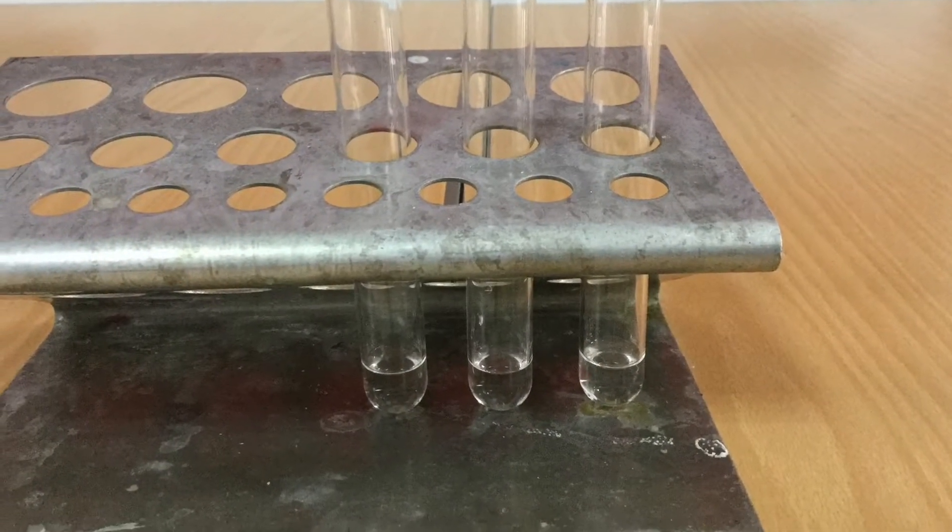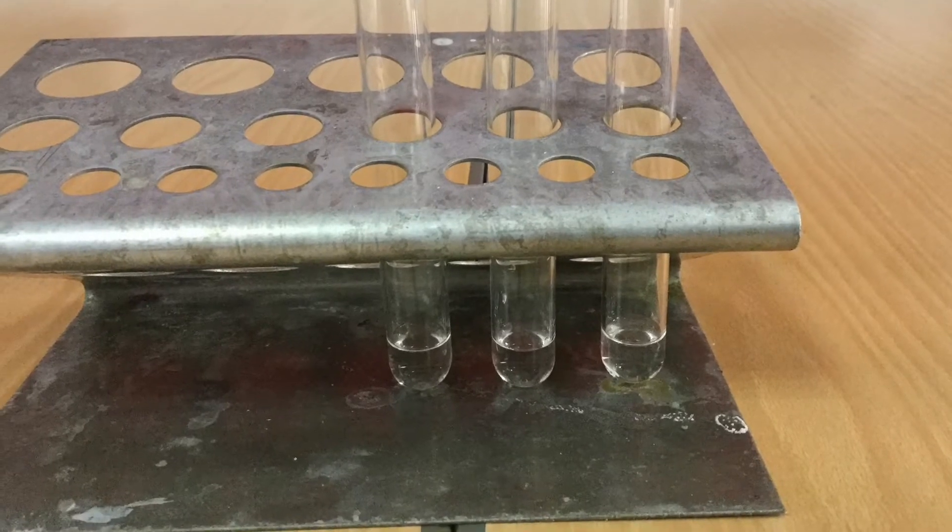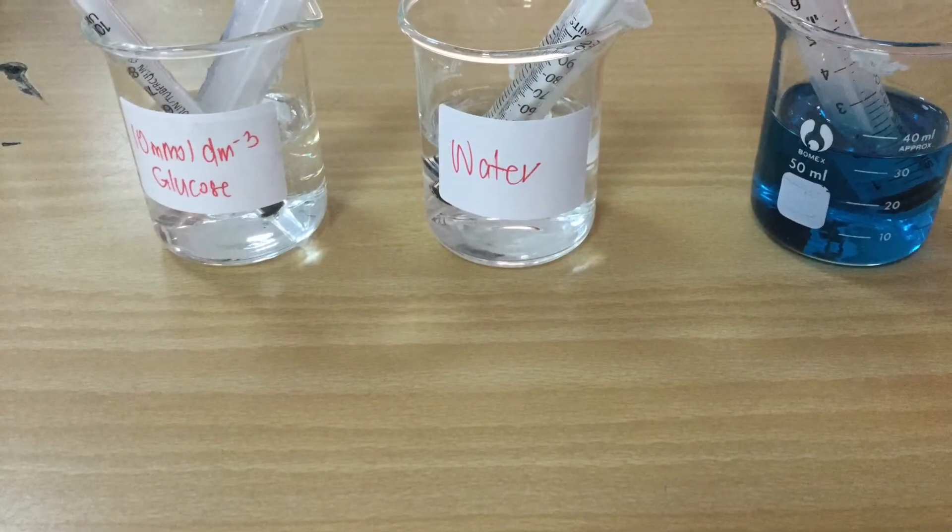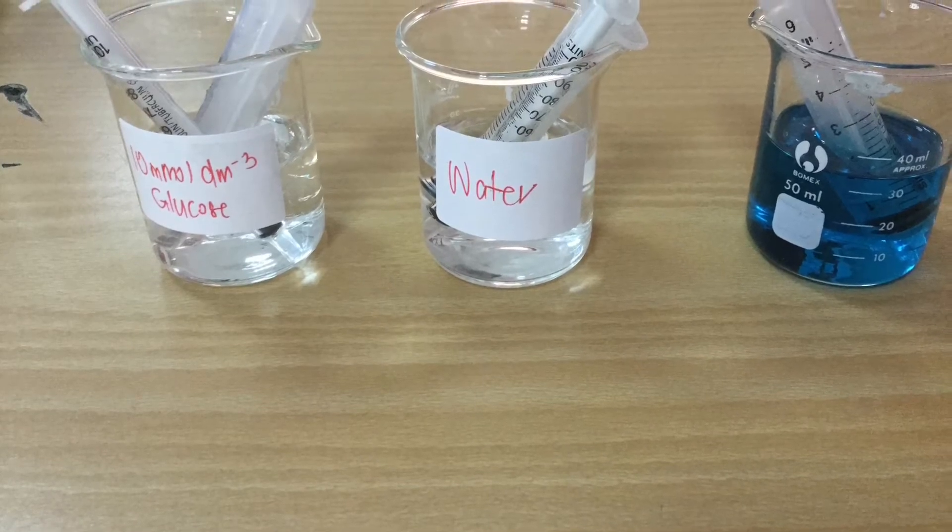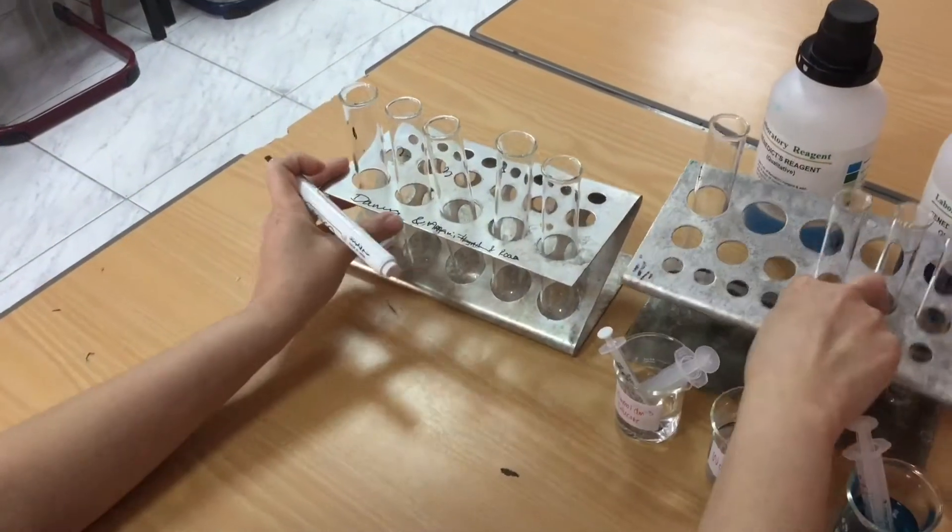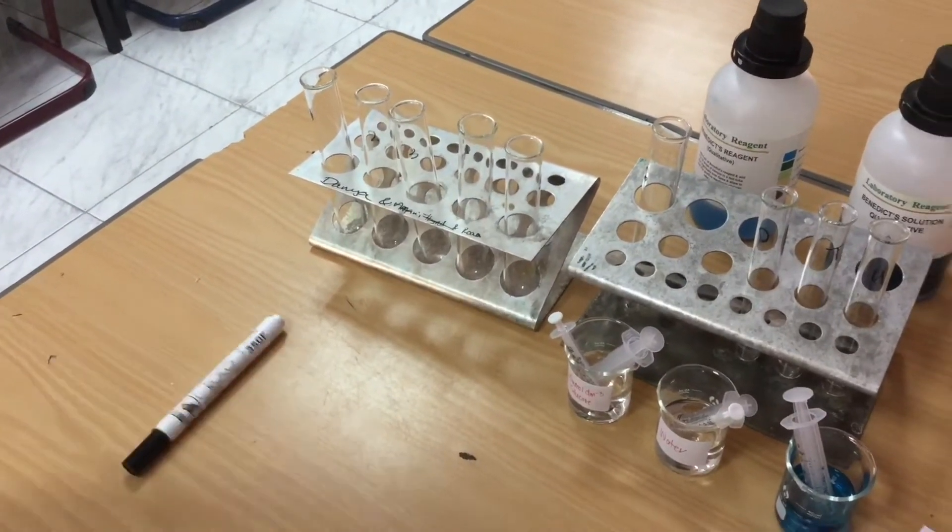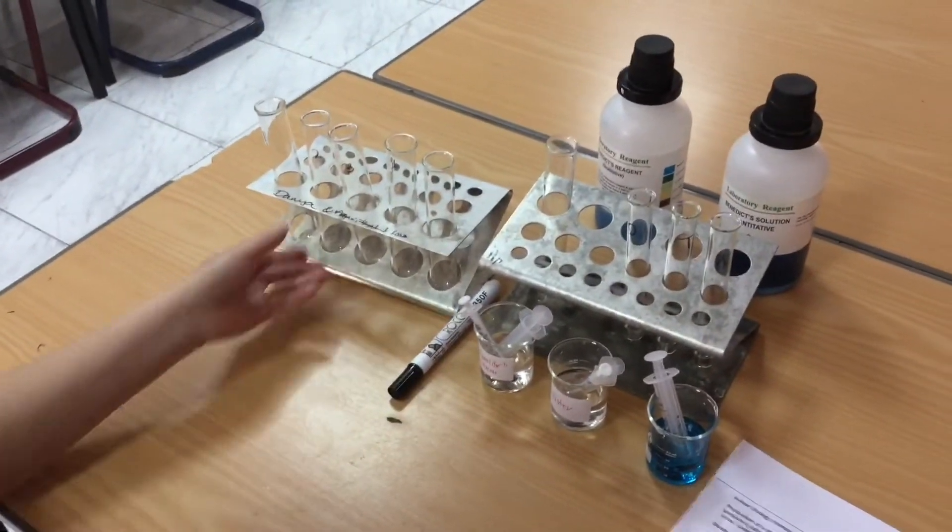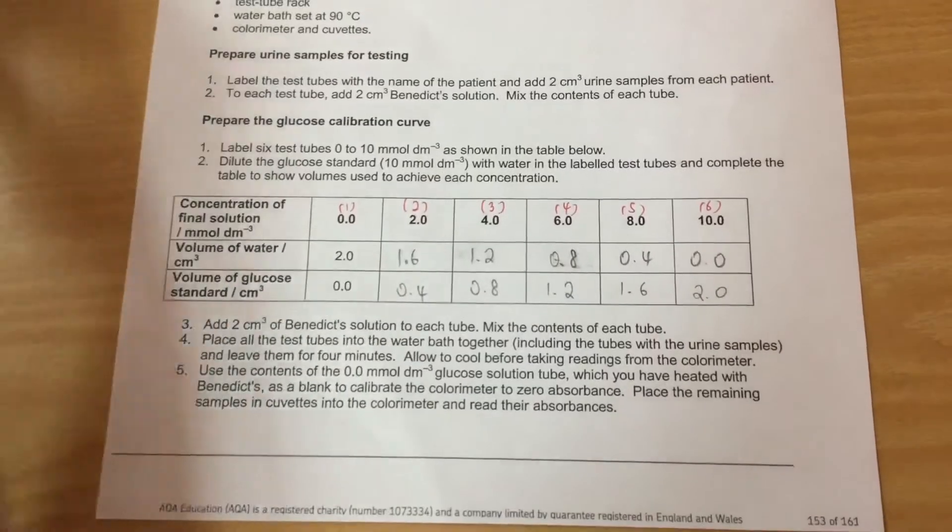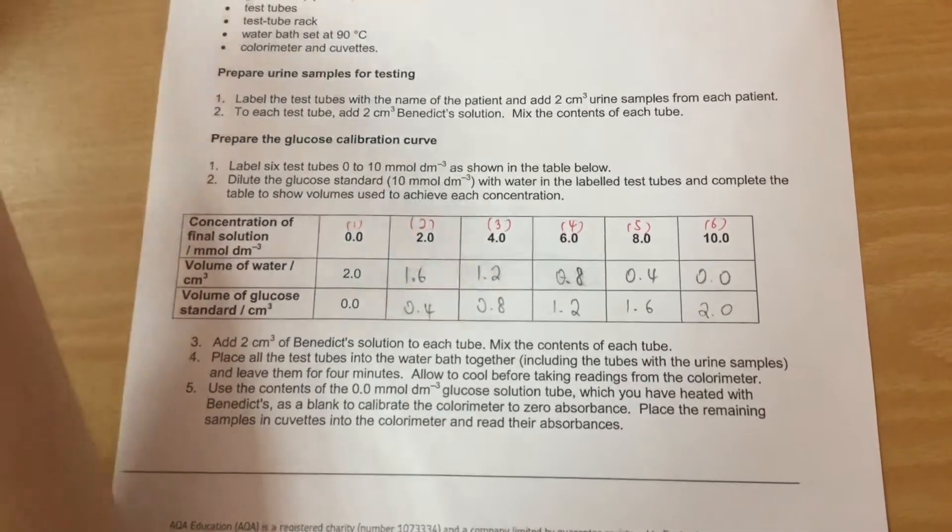Here are the three samples containing two mils of urine. To make my calibration curve I'm going to use 10 millimoles per decimetre cubed of glucose solution and I'm going to dilute it into six different dilutions ranging from zero to 10 millimoles.